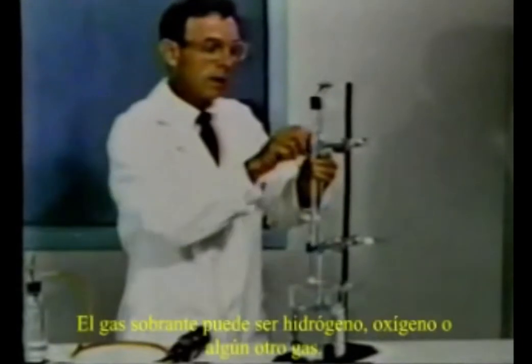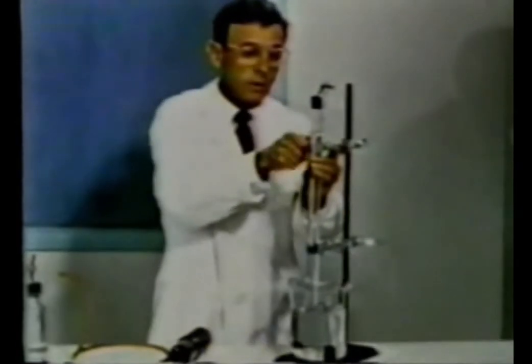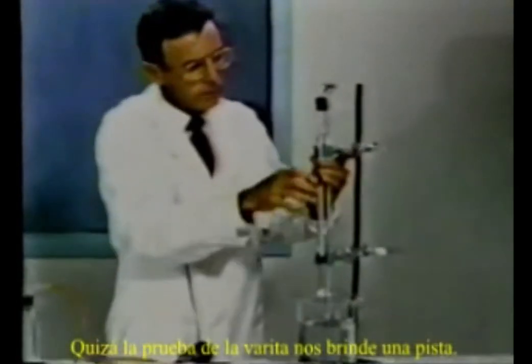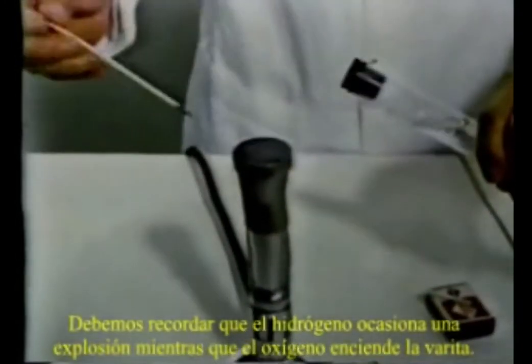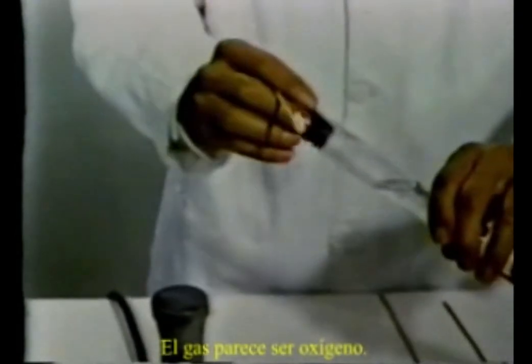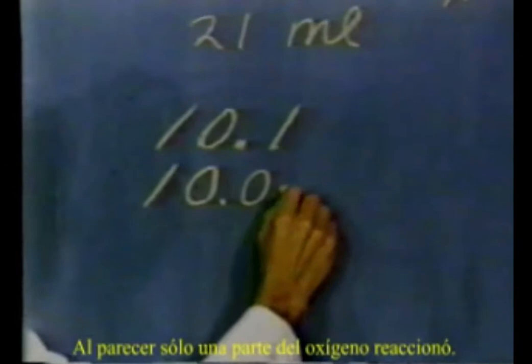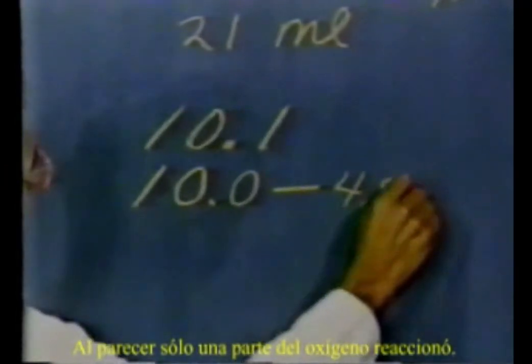The gas that remains could be hydrogen, oxygen, or some other gas. Perhaps a splint test will give us a clue. You recall that hydrogen caused a small explosion, whereas oxygen caused the splint to burst into flame. Ah, the gas behaves like oxygen. Apparently, only a part of the oxygen was consumed.